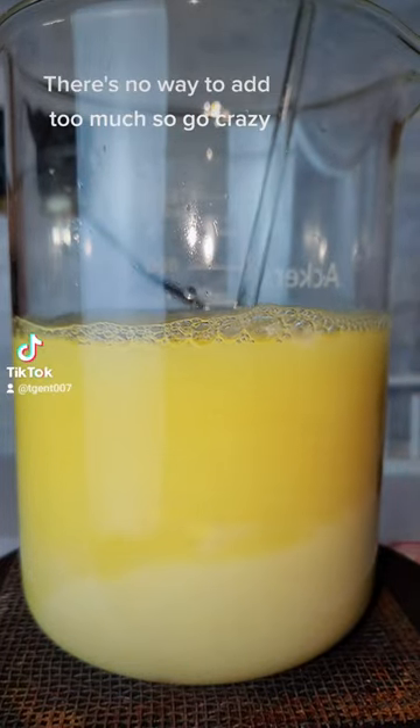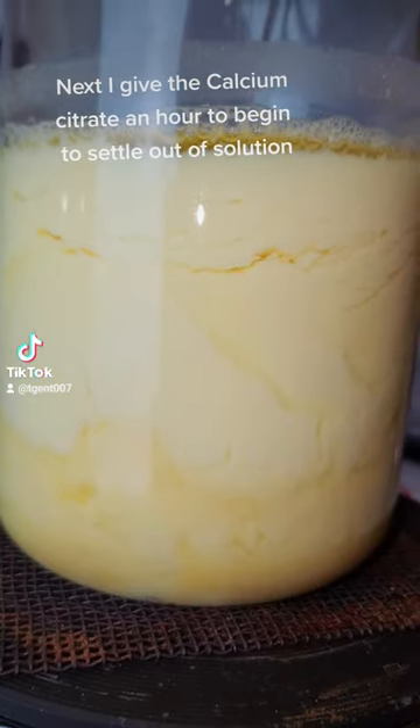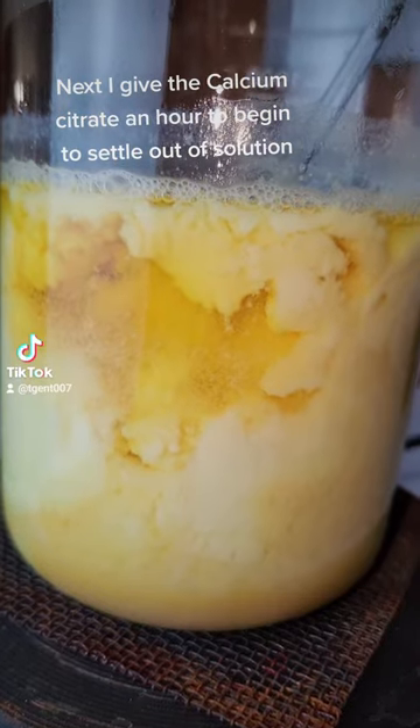which will convert soluble sodium citrate to insoluble calcium citrate. There's no way to add too much, so go crazy! Next, I give the calcium citrate an hour to begin to settle out of solution.